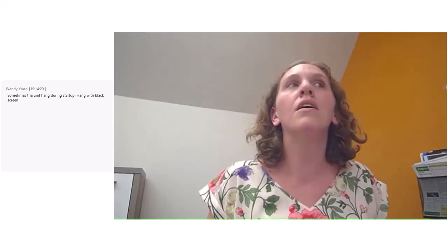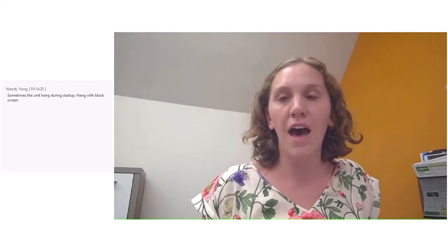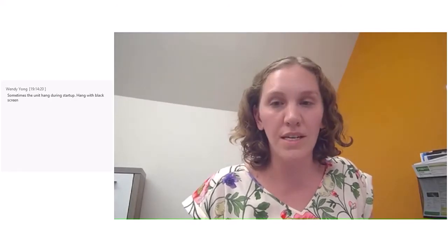Okay, so I'm sorry, I didn't hear the beginning of that question, but were you talking about the density filters? Yeah, the neutral density filters. Okay. To my understanding, we were testing the different filters to see which one would give you a cleaner, crisper image. And there should have been 2 filters, am I correct, Susie, that were included in that shipment? A 0.5 OD and a 2 OD. A 0.5 and a 2 OD. That should have been included.